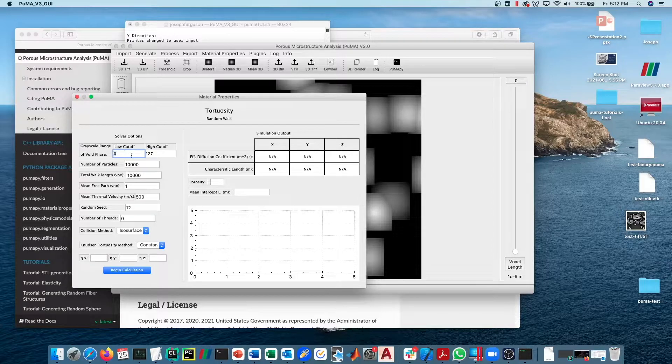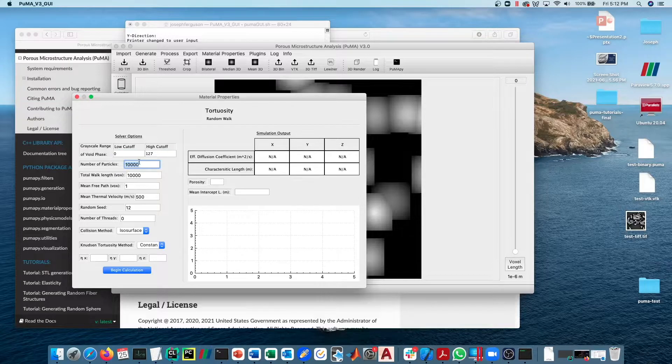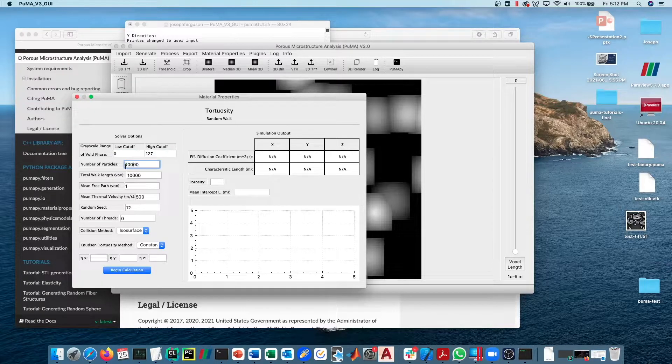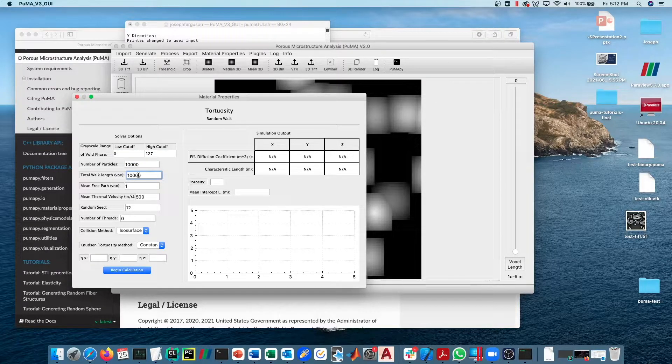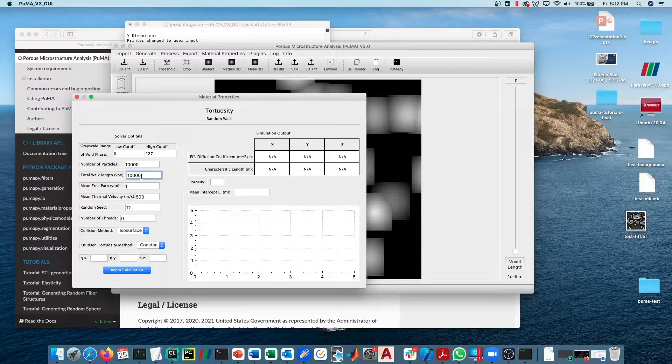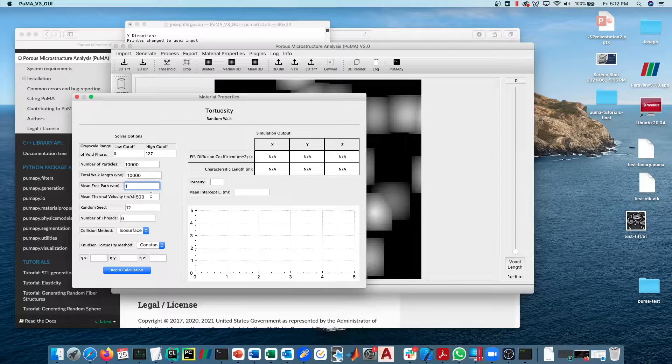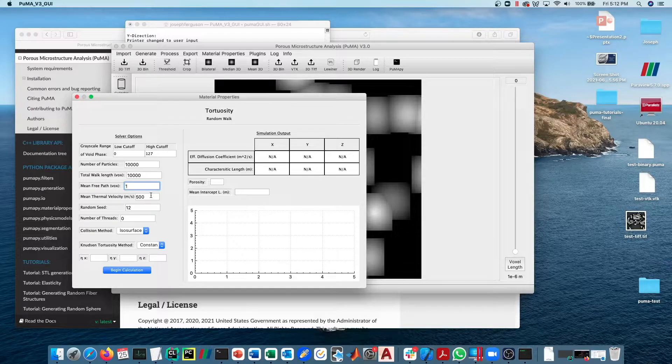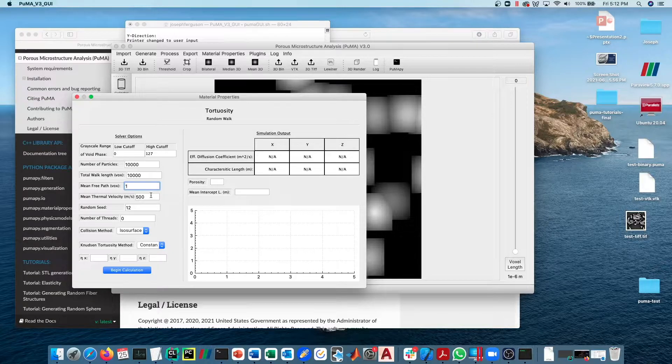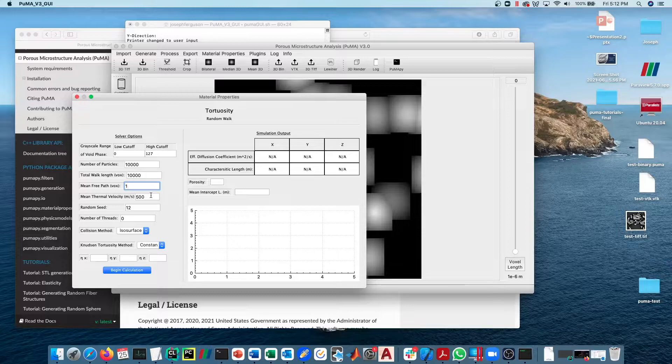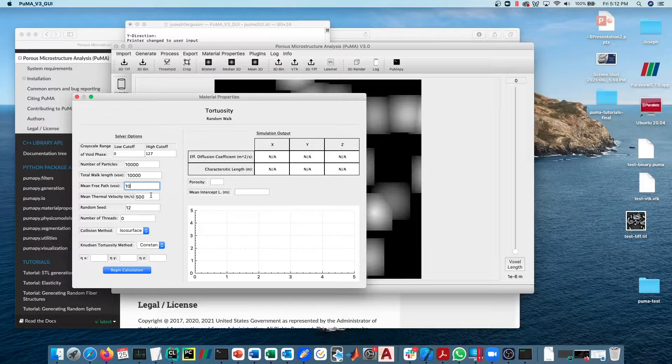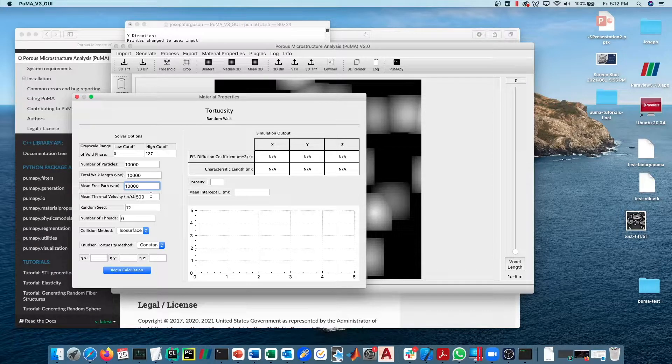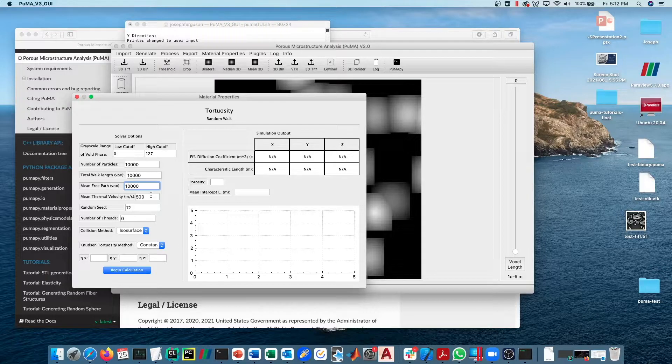Similarly to before, we're going to say a grayscale range of 0 to 127. We're going to specify 10,000 particles is fine, total walk length of 10,000 is fine. Now mean free path here is important. Mean free path, and this is going to be in voxels, is the average distance that the particle travels before it assumes statistically that it's had a particle-particle collision and then it'll change directions. If this value is set to be low—and one here is reasonably low—then it's going to be in the continuum. If this value is set to be very high, then you're going to end up with rarefied diffusion.